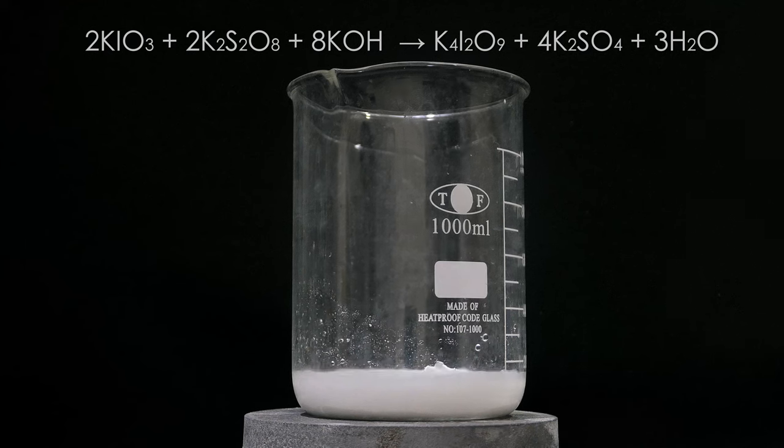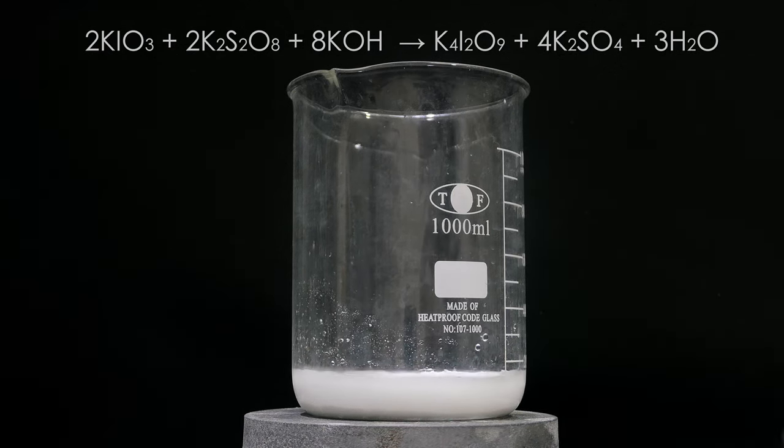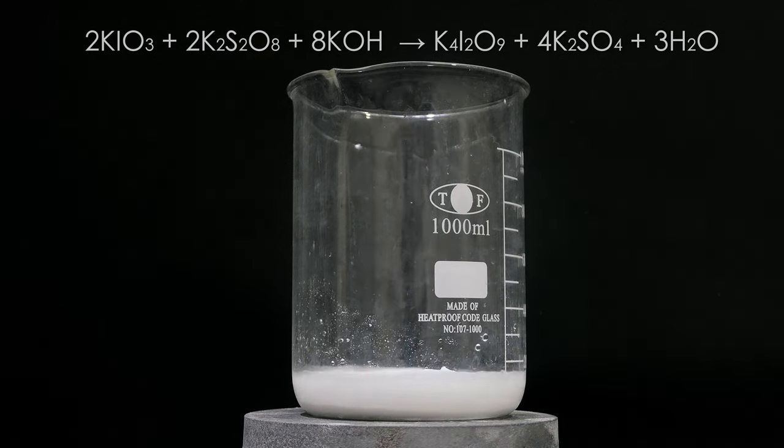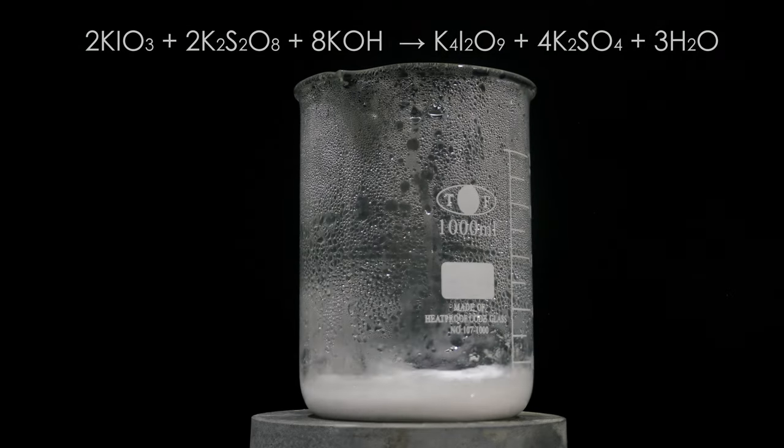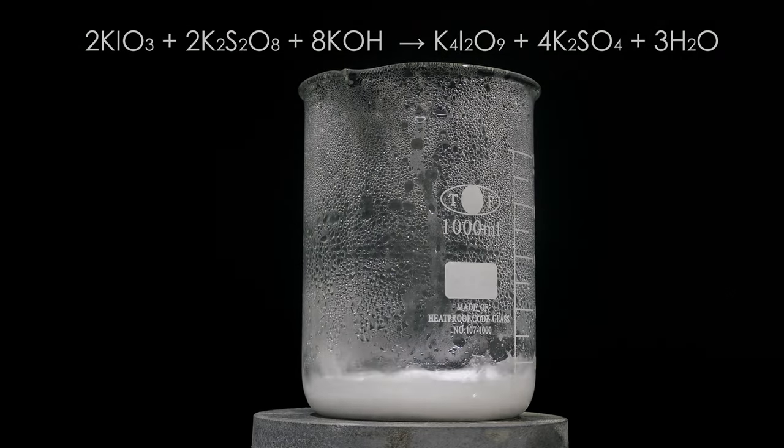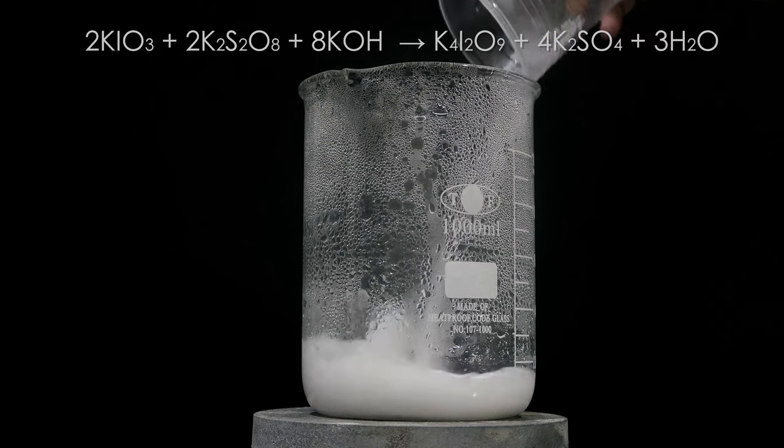Not everything was dissolved but this is fine. Then, 30 grams of potassium hydroxide is dissolved in about 100ml of water, and this solution is added to the beaker. After that, the solution is heated until boiling.